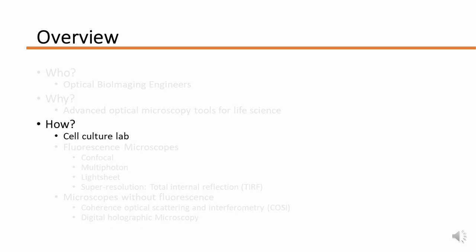In this segment of the lab tour, Daniel will present a list of selected instruments that are critical for maintaining an active cell line. He will provide a visual demonstration of how he routinely uses this equipment to culture the living cells and to use them for some of our imaging experiments.